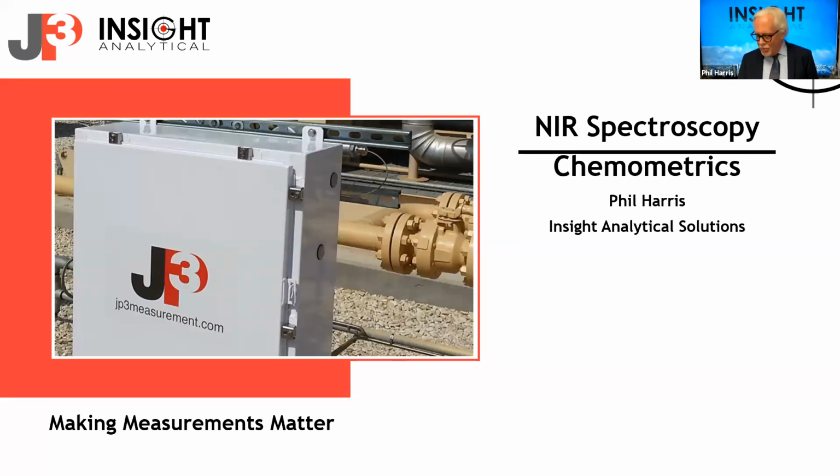Okay, so let's talk a little bit about what we're going to talk about today. We're going to talk about near infrared spectroscopy a little bit. We're going to talk about chemometrics. And first, let's talk a little bit about the players who are involved here. So of course, I have to always get started, and that means I have to get things to work. So there we go.